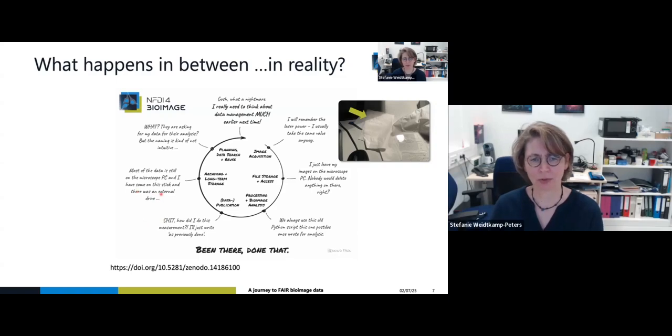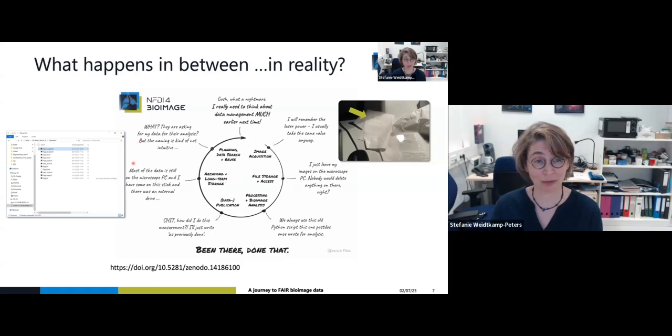And we just need a stick or an external drive to transfer them. And then in the very end, if you, for example, are going to upload this to the Bioimage Archive, they ask you for the naming, and then you have something like that. So that's in German: day 1, day 2 imaging, day 3, day 4. There's yeast, even one important information about the data, and so on and so forth.